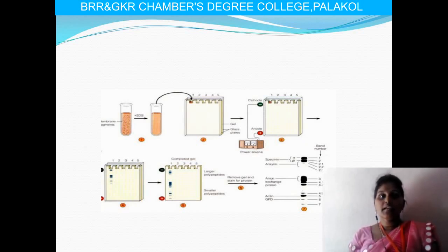The Zwitter ions will not move to either side. They will be in the immobilized state. Immobilized state means they will not move; they stay in one place. The immobilization of glycinate Zwitter ions, with the higher mobility of chloride ions, creates a high voltage. During this, the proteins have a mobility intermediate between the trailing and leading ions. So the proteins move quickly towards the chloride ions and form bands.